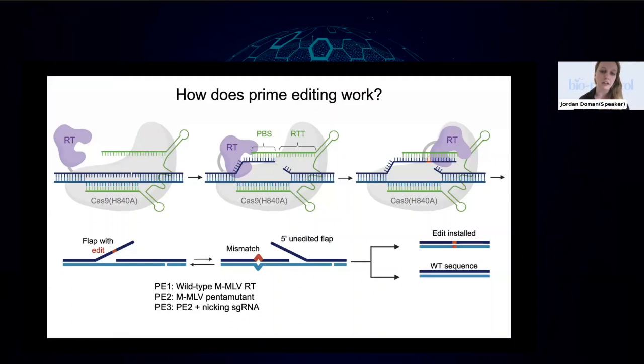So it's not a pegRNA, it's just a normal CRISPR guide RNA. Because there's no 3' extension, the only job of this second guide RNA is just to direct the prime editor protein to nick this opposite strand. Because mammalian mismatch repair is nick directed, the addition of this nick confuses the cellular MMR machinery, and instead of reverting things back to wild type, it becomes more likely to install your edited sequence.